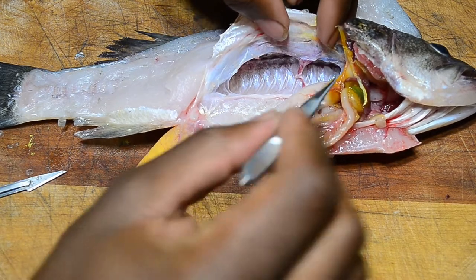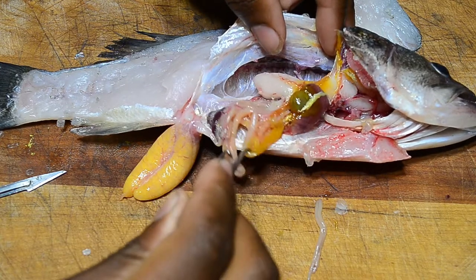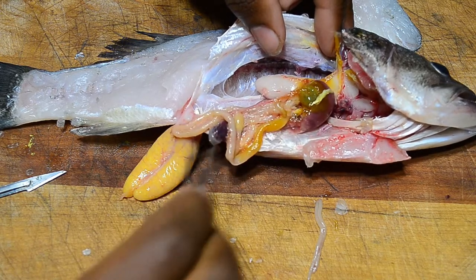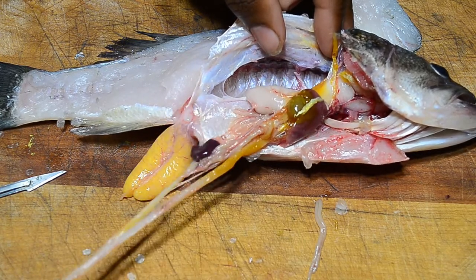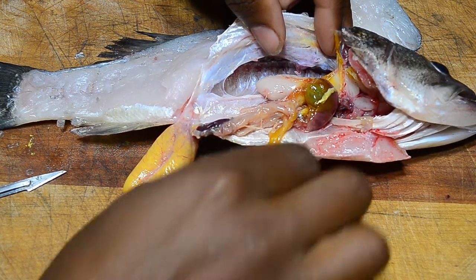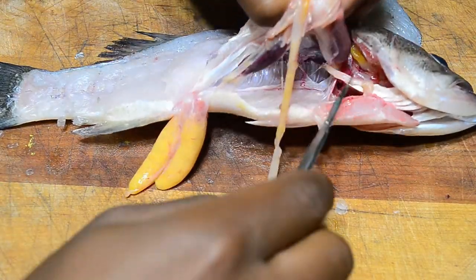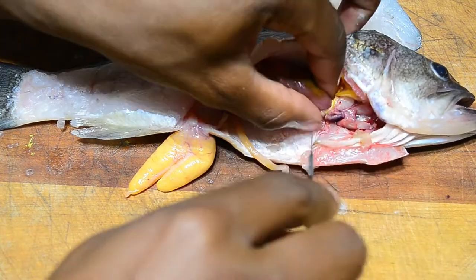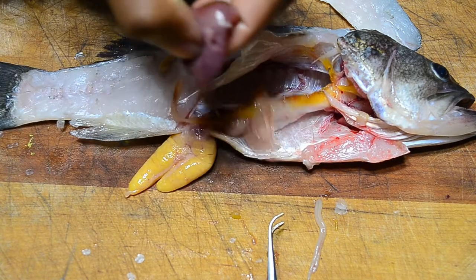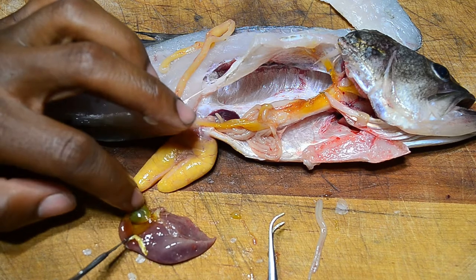Here are the intestines, and if you notice you don't see nearly as much fat in a wild-caught fish as you do in a farm-raised one. Let's take this whole section out and examine it. You can see the gallbladder.